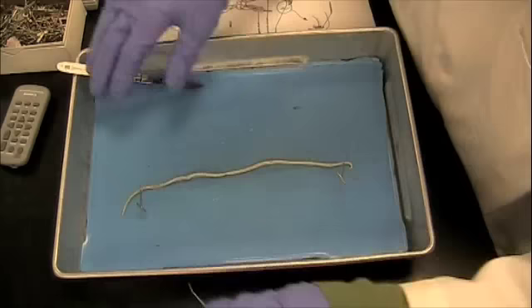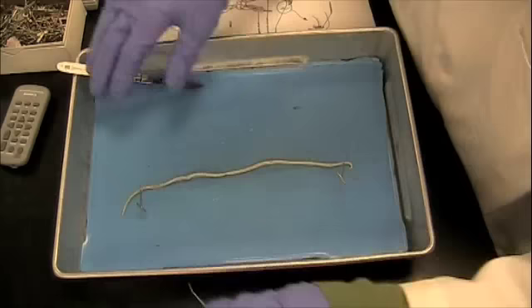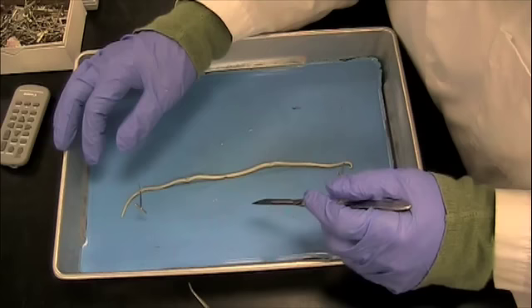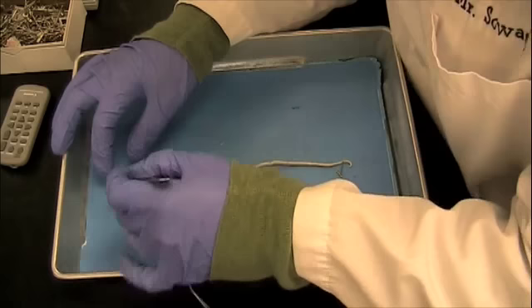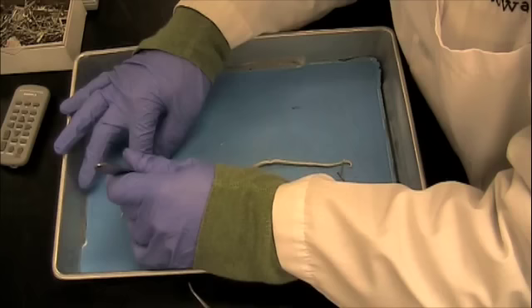This is a very simple dissection because Ascaris is a very simple organism. All we're going to do is make an incision down the Ascaris, opening it. I don't want to cut too deep and cut through the internal organs so I'm just going to make a shallow incision right along the dorsal side.